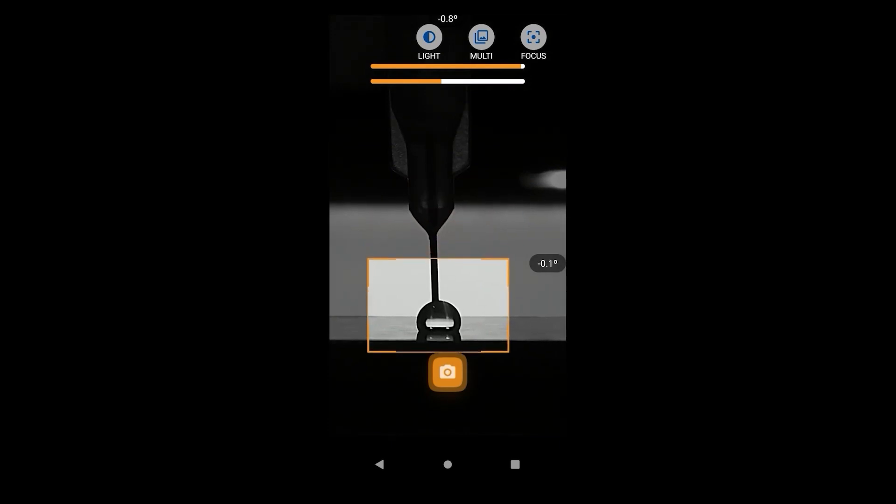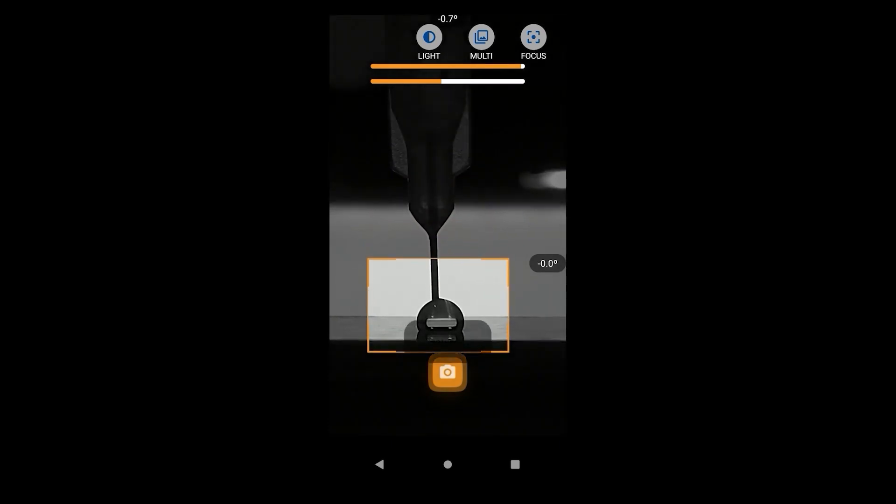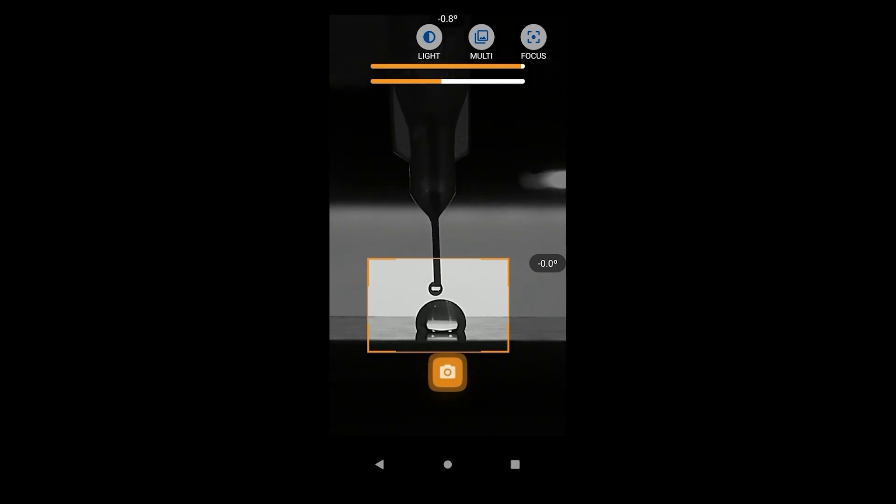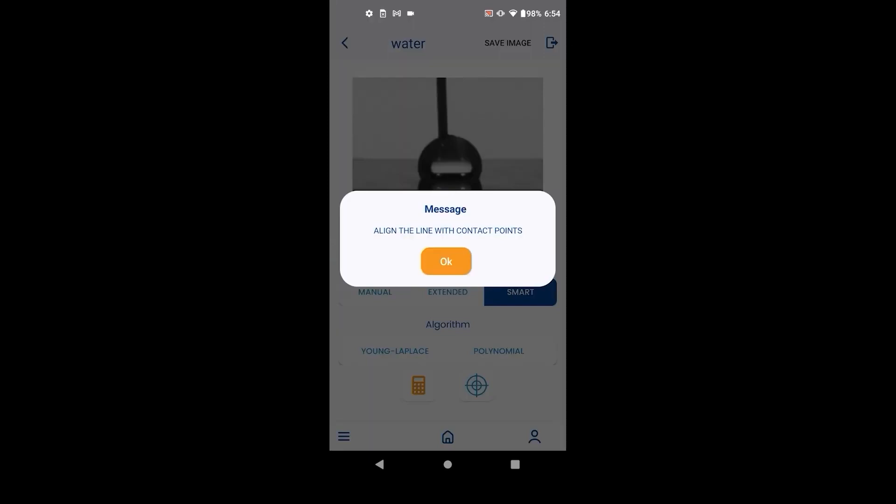Generate a test droplet to help calibrate the image settings. The camera focus should be on the droplet, not the surface edge or the needle. Hit the capture button once you are satisfied with the settings.